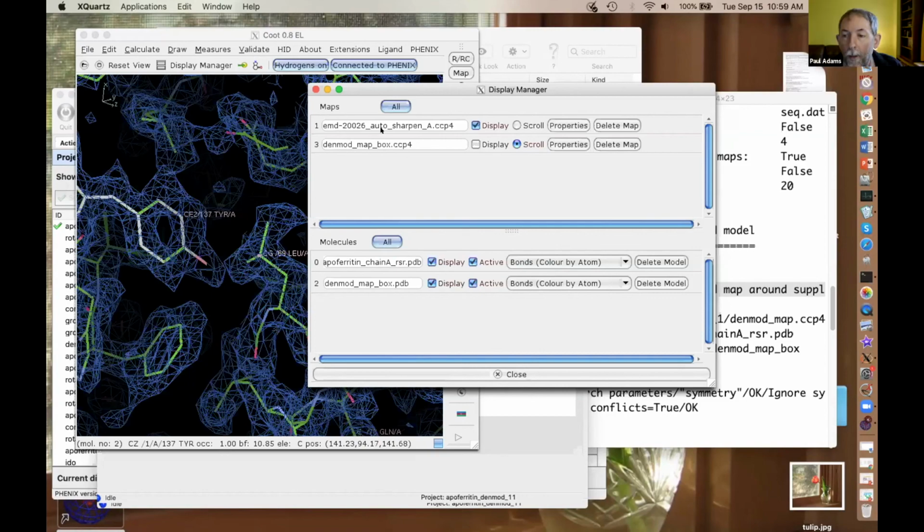Yeah. So what happens in regions in which atoms are wrongly assigned? Does it affect the density modification outcome in that region? Yeah, it certainly would. I wouldn't call it atoms wrongly assigned in the way we're doing it here. We're not identifying atoms in any particular place. We're just saying this part of the volume is macromolecule, this part is solvent. But if that's wrongly assigned, then the pressure for what it ought to look like is going to be wrong, and therefore it will affect the outcome, yes.